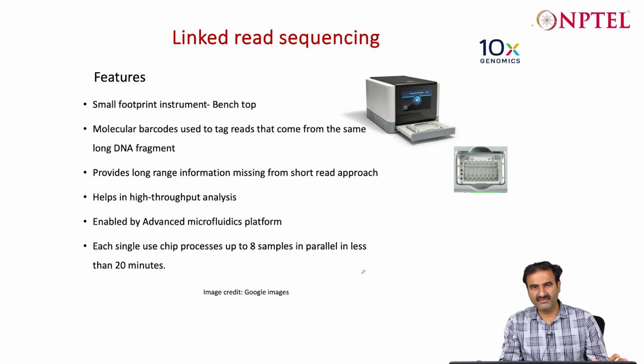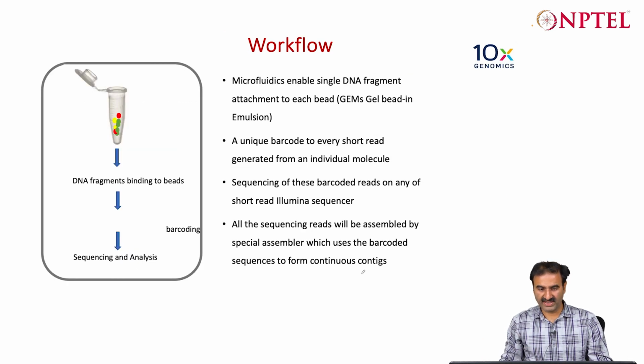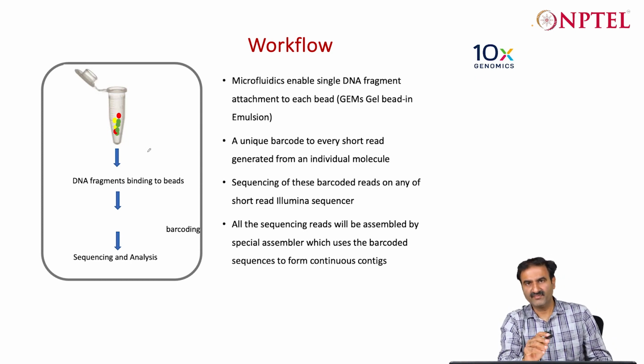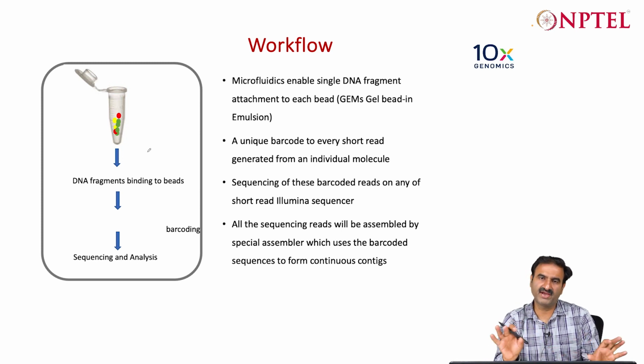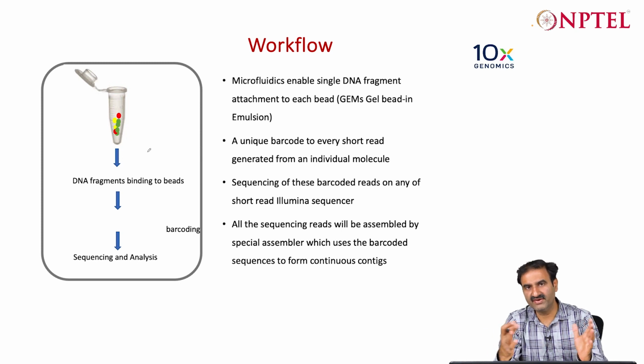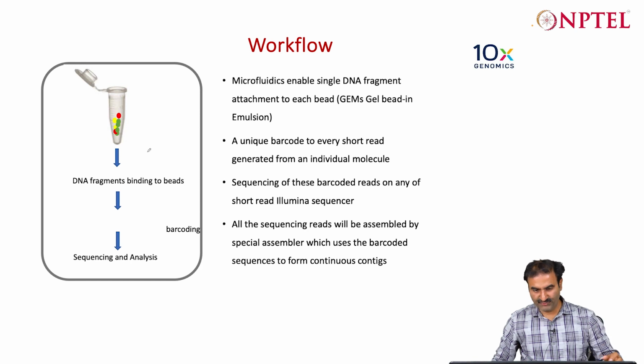Okay, then linked read sequencing was important. 10x Genomics was offering it, but these days linked reads by 10x have been stopped. Basically the concept was that you generate reads from various fragments. Different fragments are labeled differently, and the subreads generated from all those fragments are also labeled differently. So each long fragment is sequenced separately with the label, and later on those labels are used to resolve it.